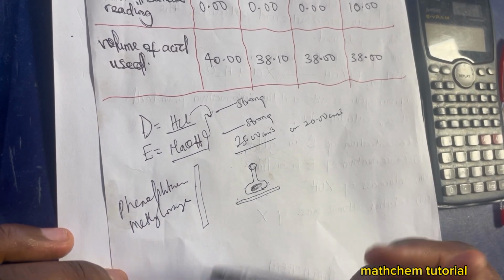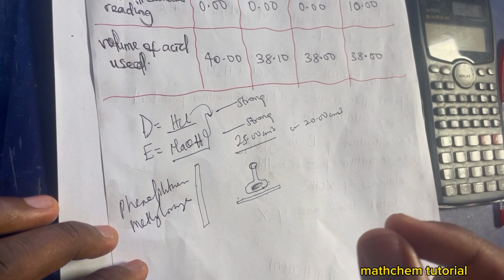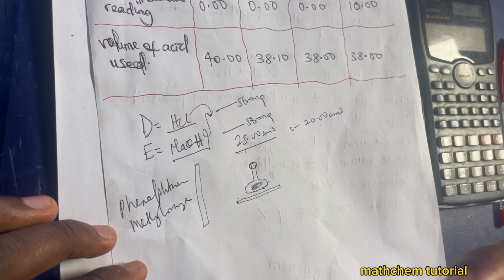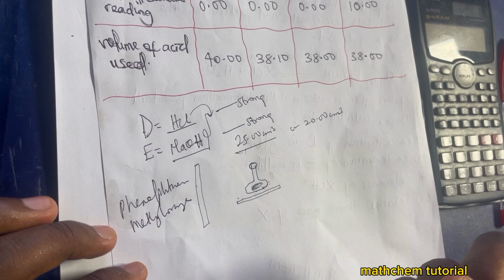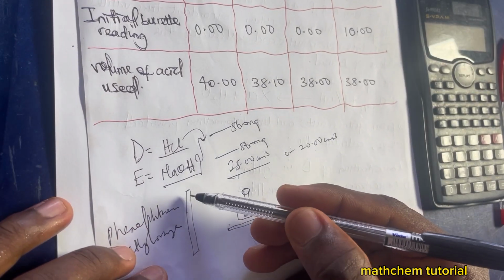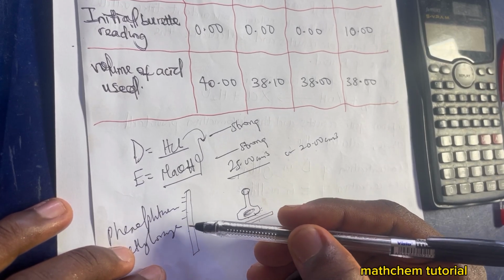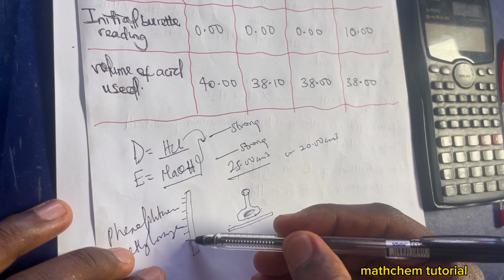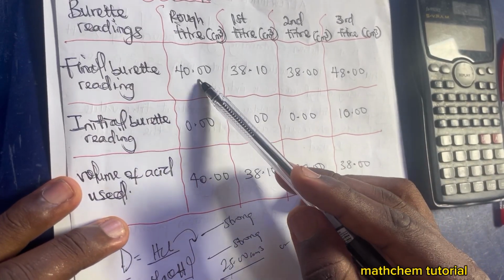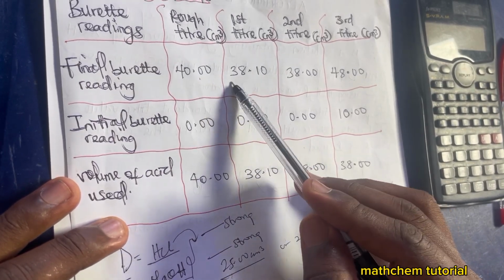So once you start running your titration, then you shake. You understand? So always press your burette slowly. Then you shake, you shake, you shake. Once you observe the color change, then you're going to stop, and that will be your end point. Color change is your end point. You will now read the volume of your burette. Burette is in a graduated scale. So you will now read the volume of your burette, then you write it there, and ensure to put it in two decimal places.